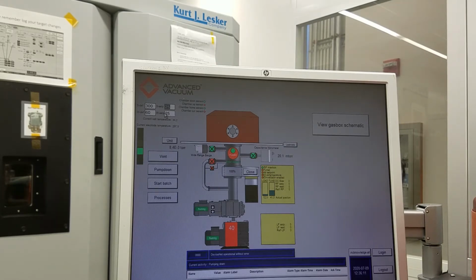The reason for that is when you come in using this tool, the set point is either both 25 or both 0. The tool is not in use. It's a cold chamber and a cold substrate holder.